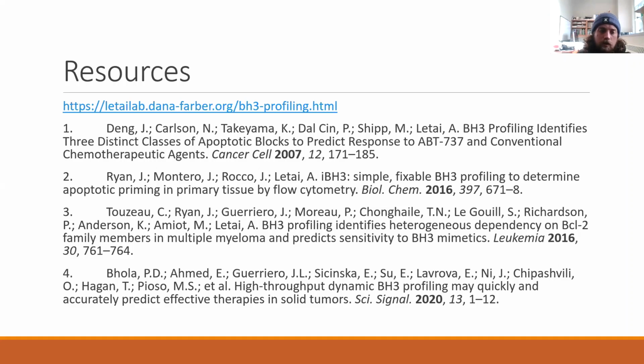And will it permeabilize all the cells homogeneously? Because some detergents rely on interactions with cholesterol, and if cellular membranes have different levels of cholesterol, could they be permeabilized in slightly different ways? This might be way too specific. Sometimes I focus on nitty-gritty details that don't actually matter.